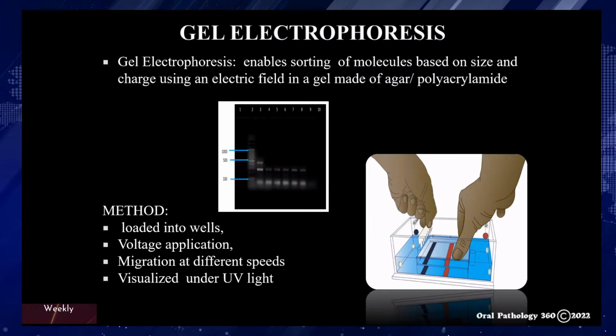Several different buffers have been recommended for electrophoresis of DNA. The most commonly used for duplex DNA are the tris acetate EDTA and the tris borate EDTA. DNA fragments will migrate at somewhat different rates in these two buffers due to differences in ionic strength. Buffers not only establish a pH but provide ions to support conductivity. If you mistakenly use water instead of buffer, there will be essentially no migration of DNA in the gel.